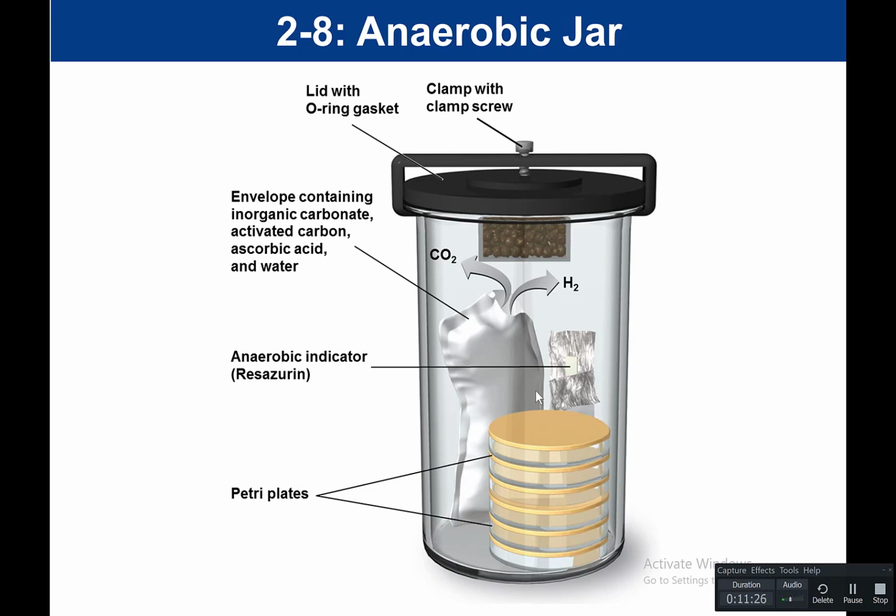And so the next set of slides are basically just explaining about different O2 requirements. These slides are a little bit different. The ones you'll see in this video are a little bit different than what's in your lab PowerPoint. The slides are actually pulled from chapter 6 from lecture. So same content, the slides might look a little bit different, but the idea is the same. And it's talking about basically the O2 requirements for different organisms.